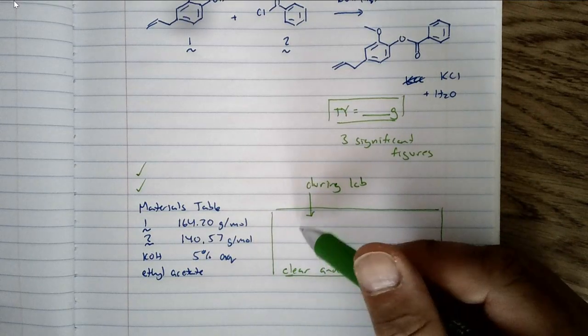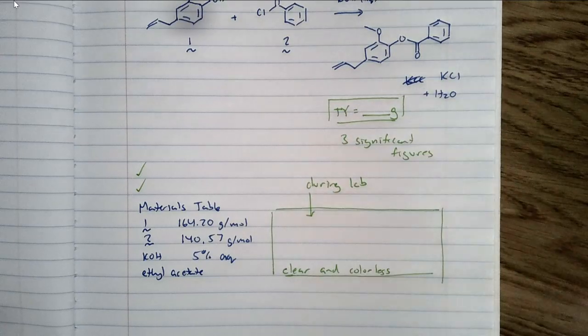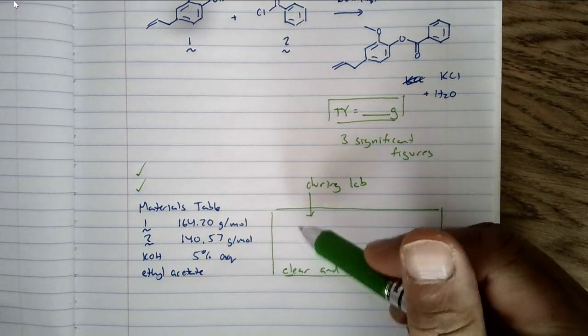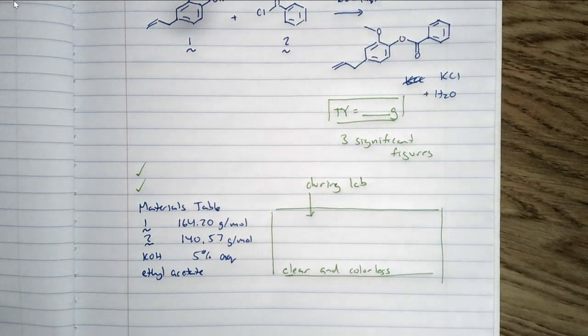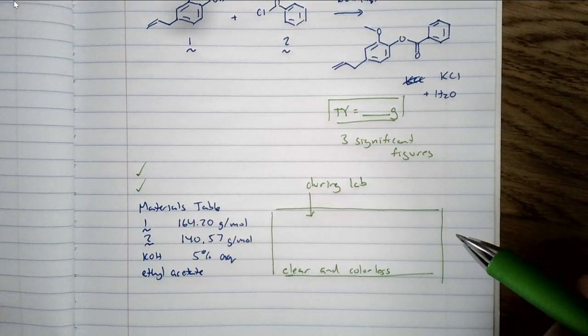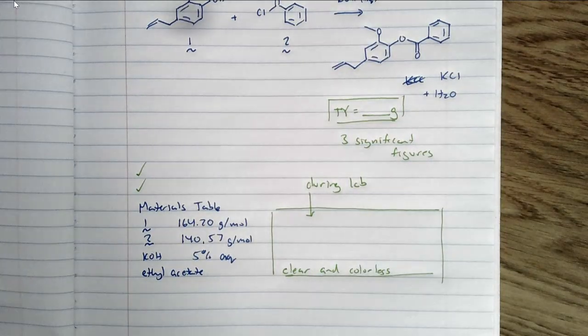Now, if it's discolored and it still works, great, right? We're not going to waste it. We're going to use it. And so that's why, again, you want the characterization, because in case it does work, you don't have to worry that it's brown if you want to rerun the reaction again.